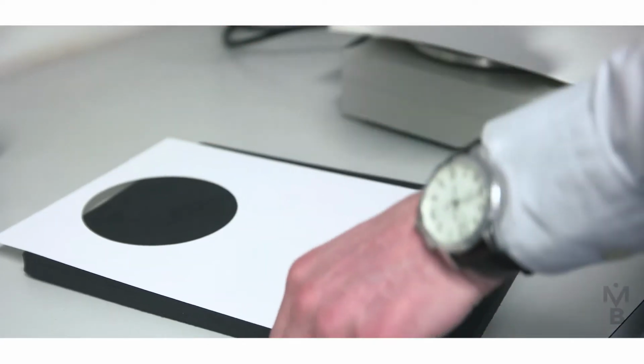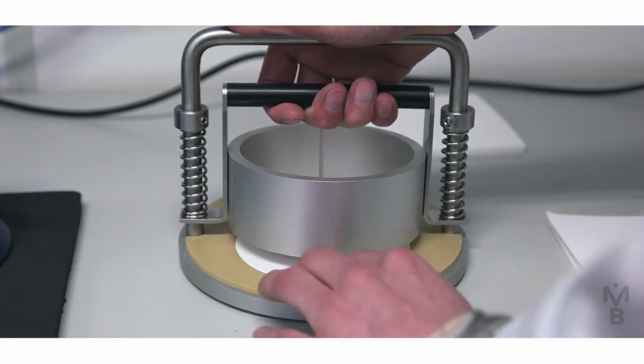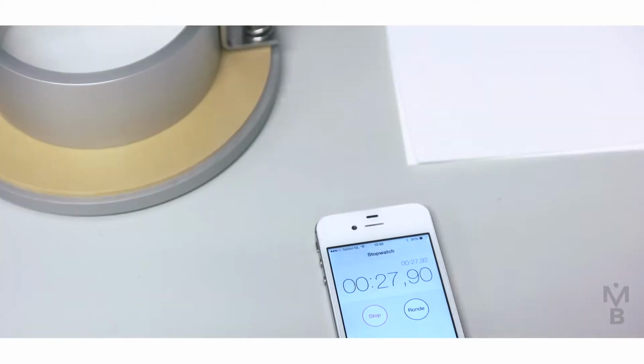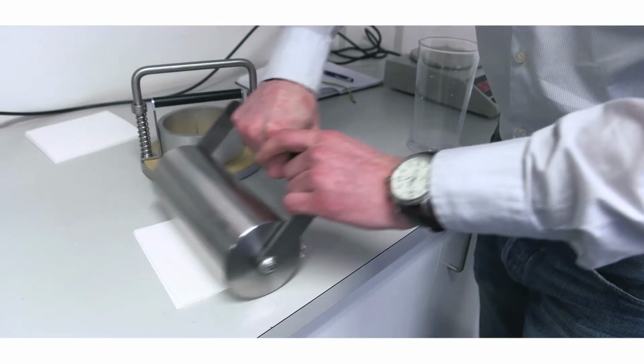Manual Cobb, on the other hand, is a standard. That's what people are using, and that's what they've been using for 50 years. It's a test that everyone does that they would like to replace, mainly because it's less accurate, it's not as repeatable, and there's a lot more variability in the test result because of operator to operator dependency.